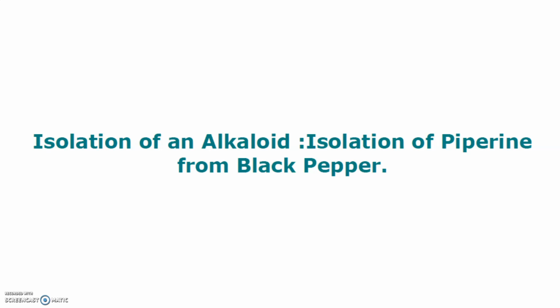Today in this video we are going to learn about isolation of alkaloids, isolation of piperine from black pepper. First I will discuss the alkaloids, then I will focus a little bit on piperine, and then I will show you how to isolate piperine from black pepper. So let us start.